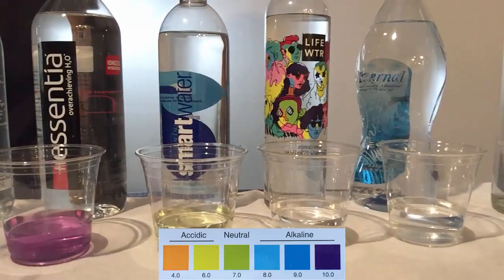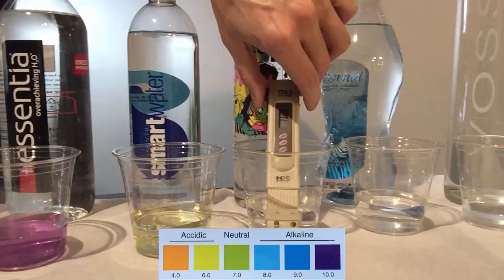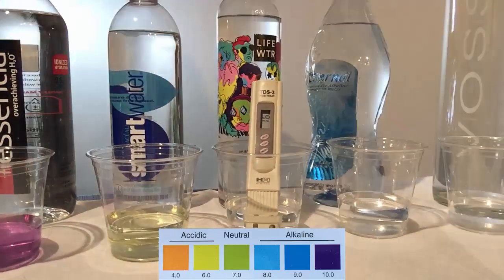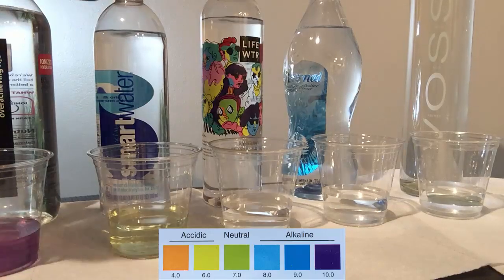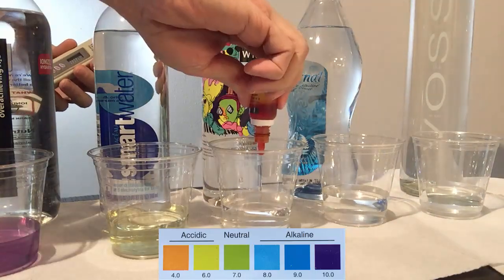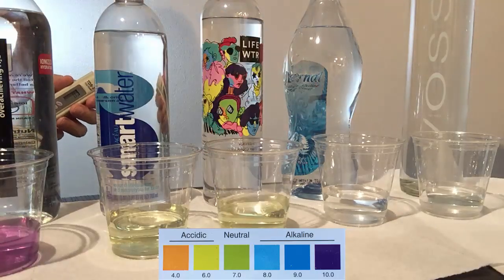Next one is Life Water by Pepsi-Cola. This water has been purified through reverse osmosis and then had some minerals added back, and a TDS of 16 is even lower than Smart Water. The pH looks just as acidic as Smart Water.